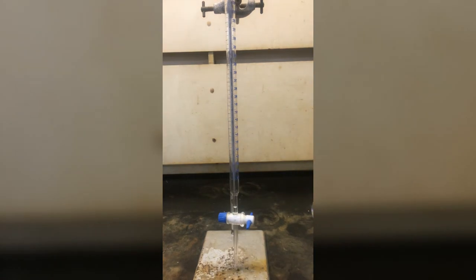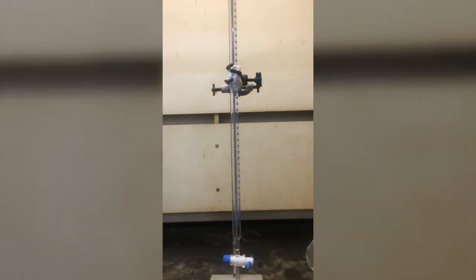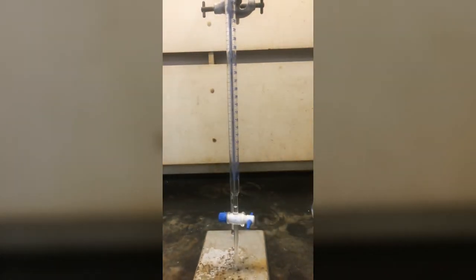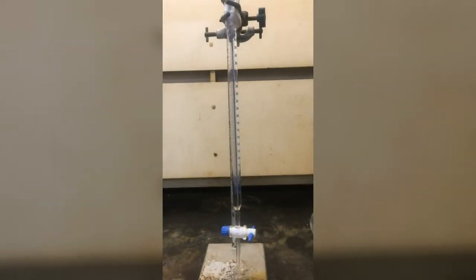Now, we are refilling the burette with the HCl solution. Just to mention that when you're filling your burette, don't fill to the zero mark. This will affect how you estimate your initial reading to the nearest two decimal places. Remember to remove your funnel before taking your initial reading and read at eye level below the meniscus.